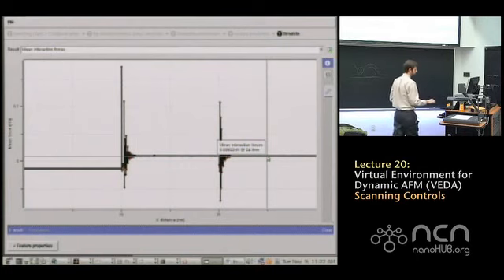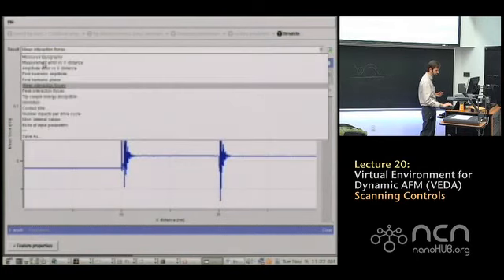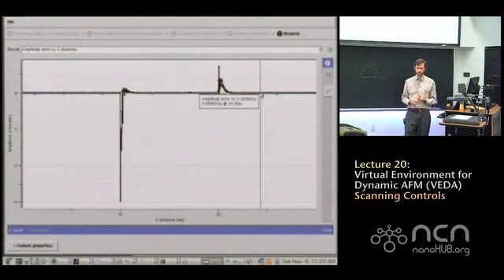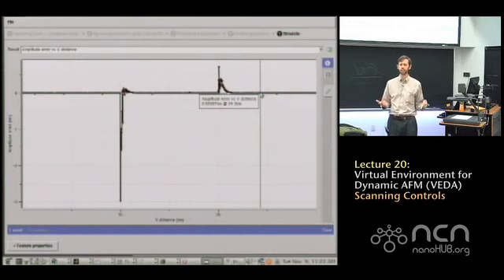And you'll see that actually, as far as the controller is concerned, it's reached a 0 error. The error map is 0. So the controller thinks that it's doing its job because the error is 0. But there's 2 different z locations where you can have a 0 error. So it just so happens you got the wrong one.